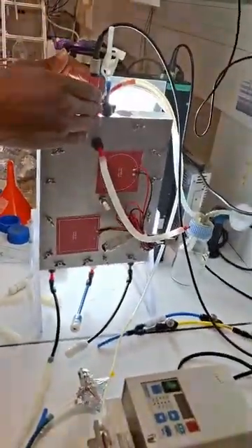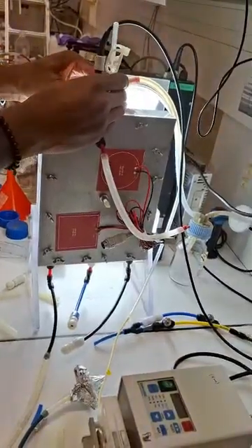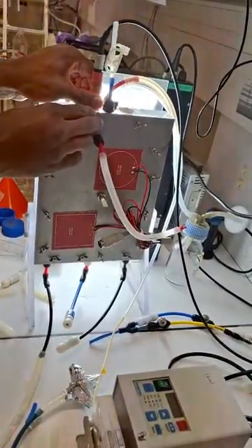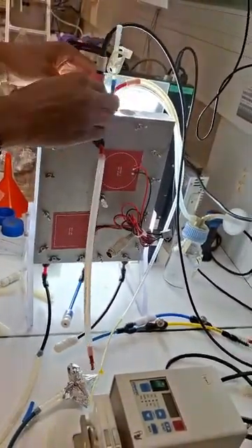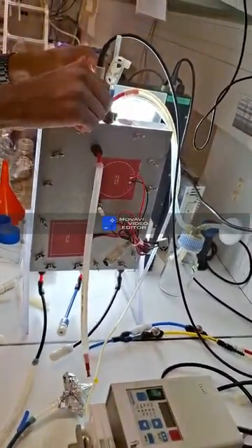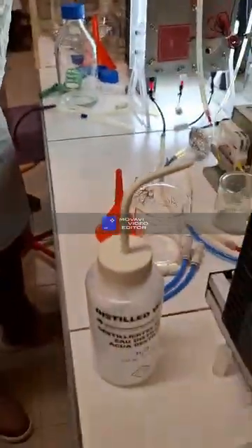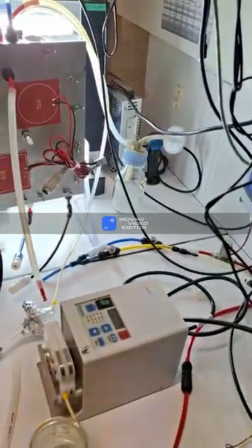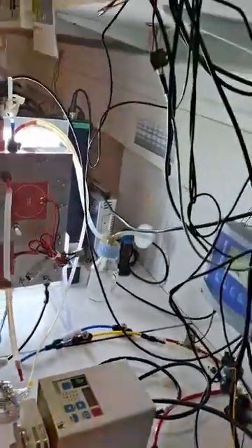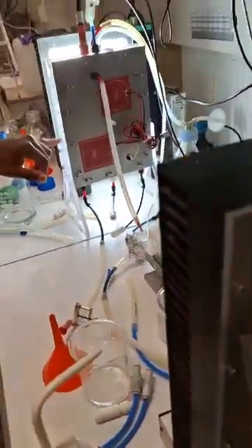Because now the goal is to sterilize the closed system. Yes, now it's fully closed. Okay, so it's good. So what time is it? So it's 10 minutes left after we put the solution.